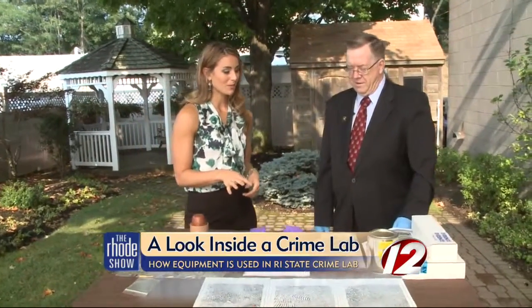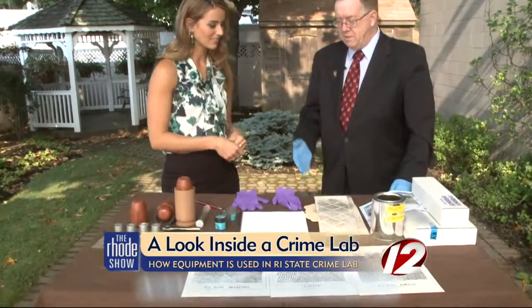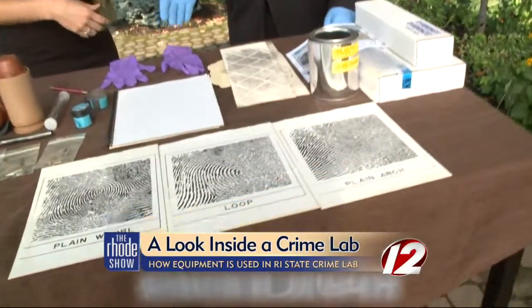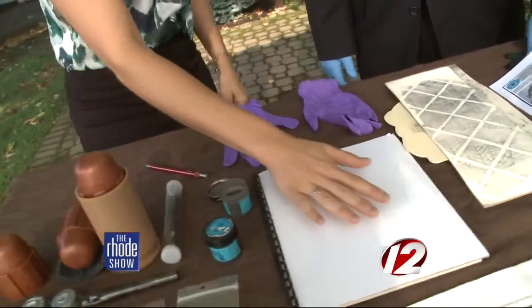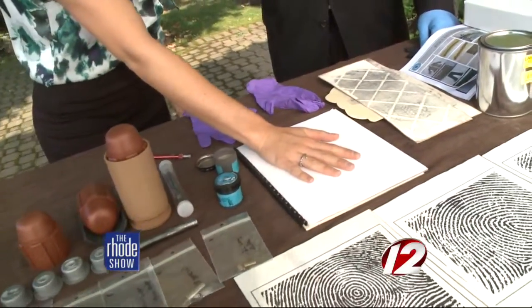Good morning. Thank you for inviting me. When you told me that we could do some fingerprinting, I figured let's just jump right in. I don't want to waste any time, so tell us about this. So the easiest way to do fingerprints on paper is for you to place your hand on that piece of paper. No prep needed — just using the regular sweat from your hands to pick it up.